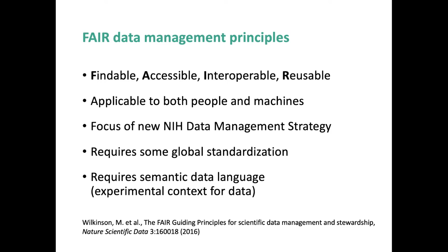To actually have FAIR compliant data, there has to be some standardization of how people record and manage their data. In addition, it requires a semantic data language. Any given analytical result needs an experimental context that's understandable to the person looking at the data. This is how we now envision CultureTrax, a common standardized semantic data language for stem cell science.